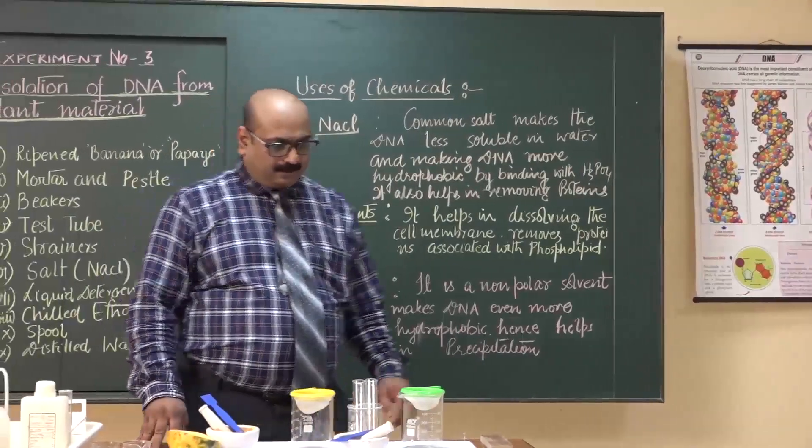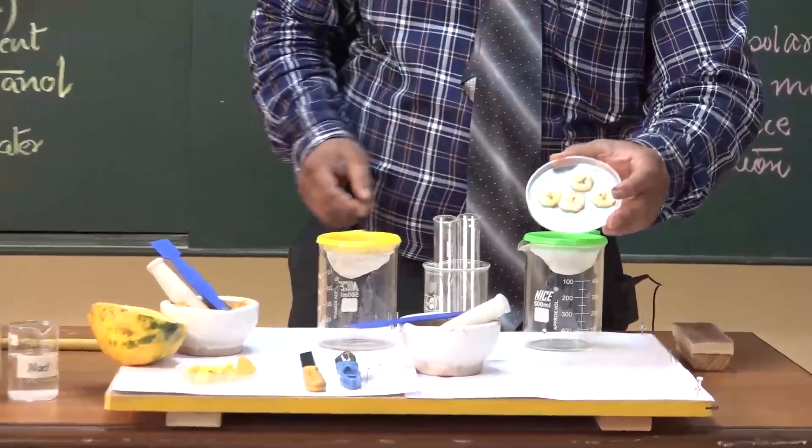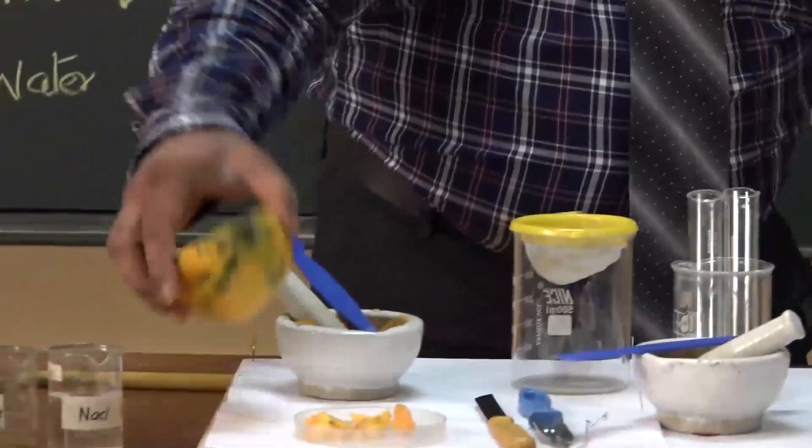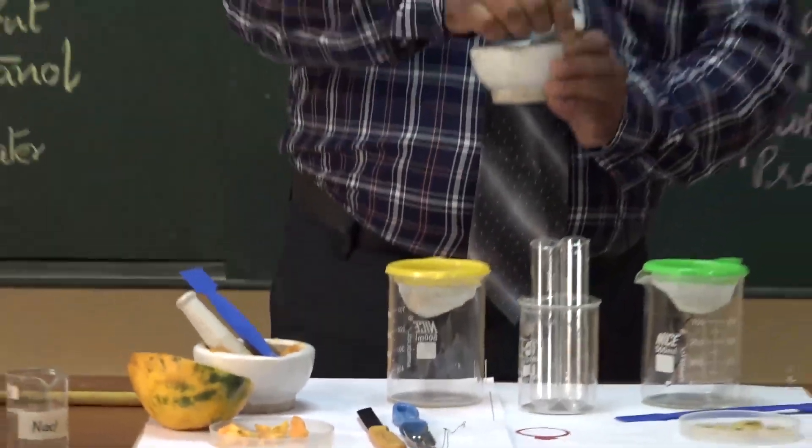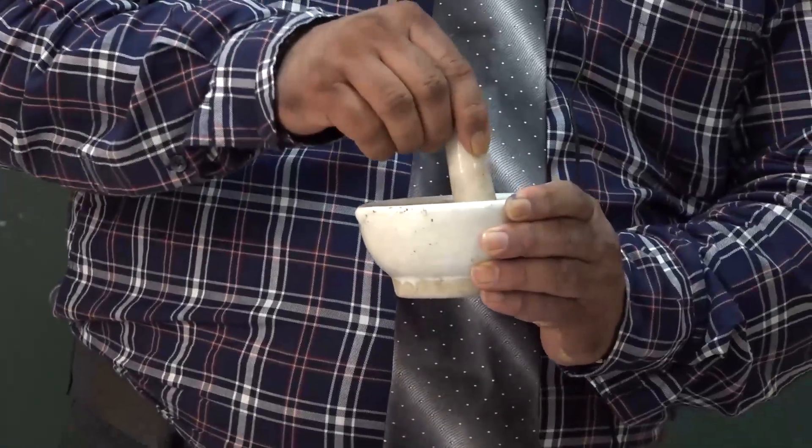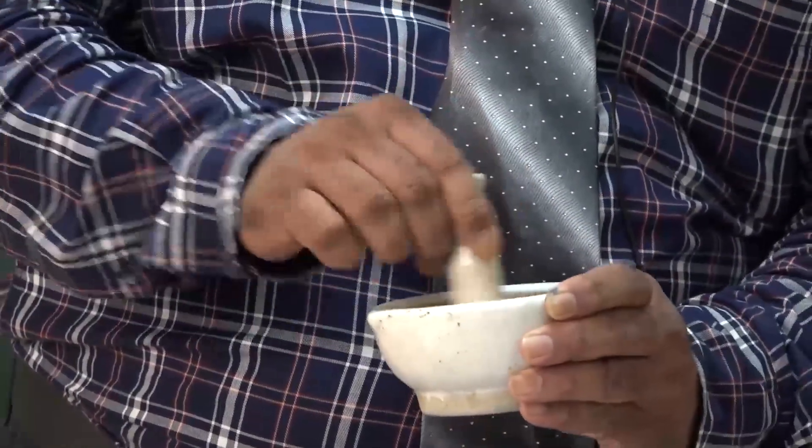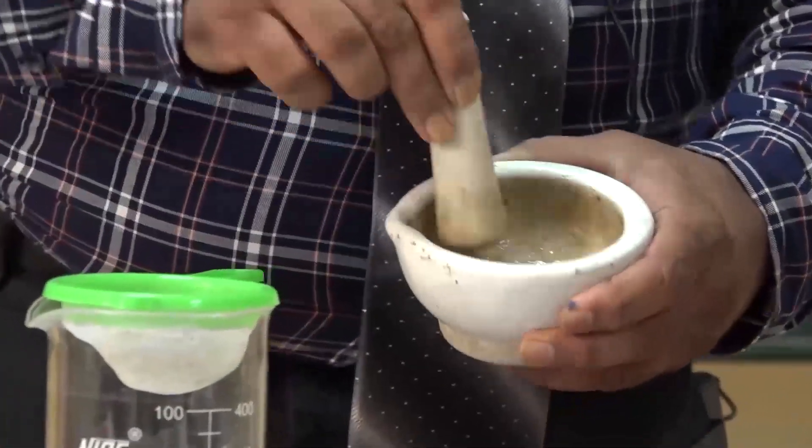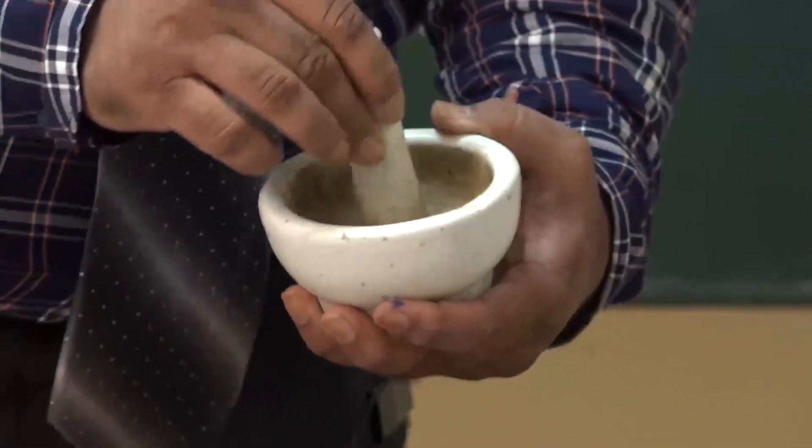Now students, let us start the practical. Here, I have cut the banana, I have cut ripened papaya also. By peeler you can peel off ripened banana. By mortar and pestle you can make a fine paste of banana. The paste has been prepared, banana was ripened and fine.